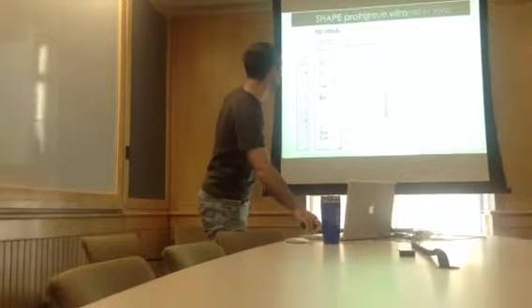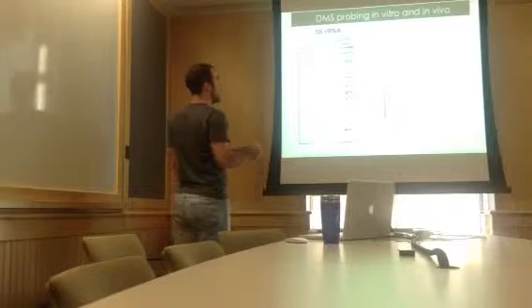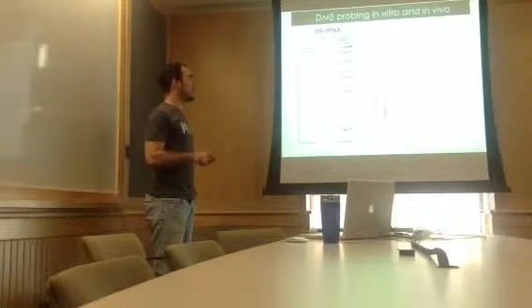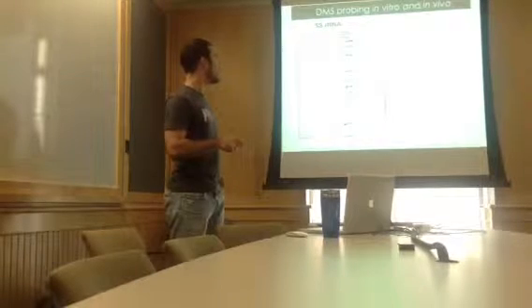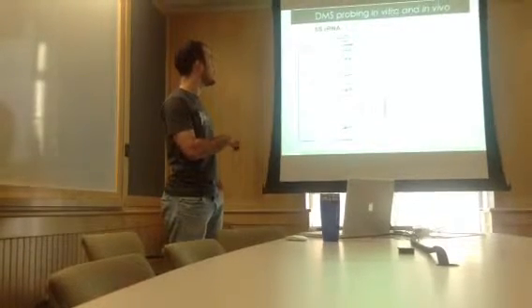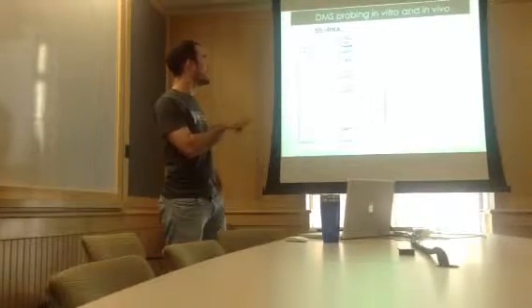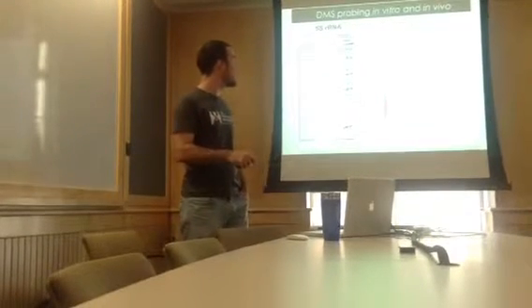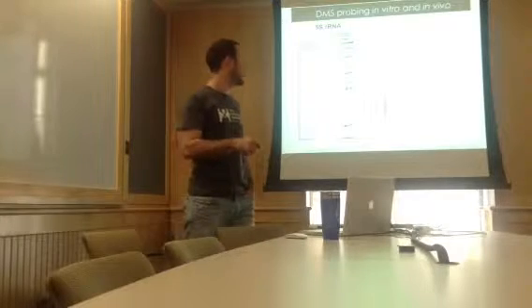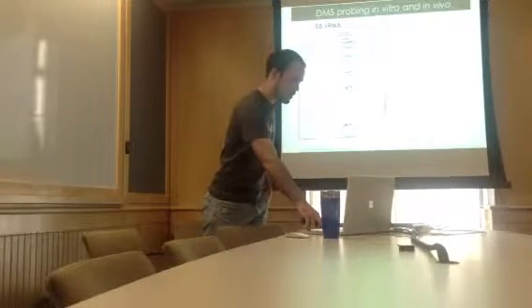with SHAPE reagent. Now, for DMS in vitro, again, I found a good concentration that allows us to have a good probing in vitro, and again, the results that we obtained for the in vitro probing correlate with the secondary structure that is predicted for a 5S ribosomal RNA.